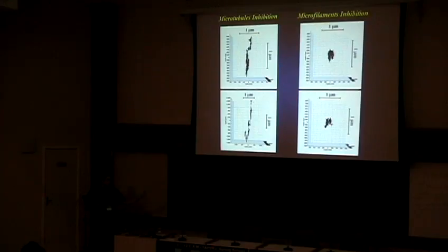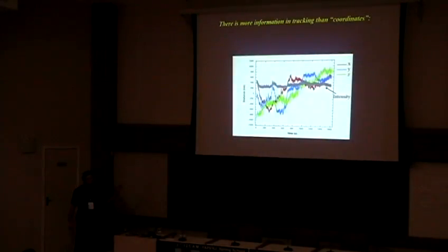But we still don't know exactly what is being used for taking this cargo to this region that's close to the nucleus. Yeah, the Z direction is not fixed. It's just because you have to separate one of the X from the plane completely. Oh, I didn't know the cell was flat. Yeah, the cell is a volume, at the peak it can be 12 micrometers. This is an animal cell.